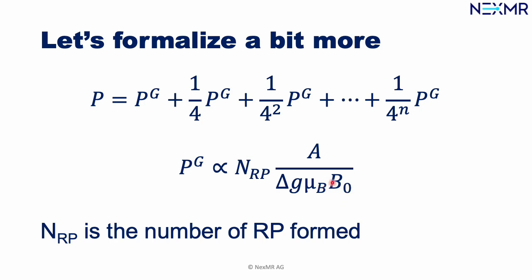So you see, if you want to increase the hyperpolarization that you generate, what you can do is to either select molecules that have a very high hyperfine coupling, or select the dye, the photosensitizer, and the molecule to have close g factors. So like this, you have a small delta g, or you can also reduce the B0 magnetic field.